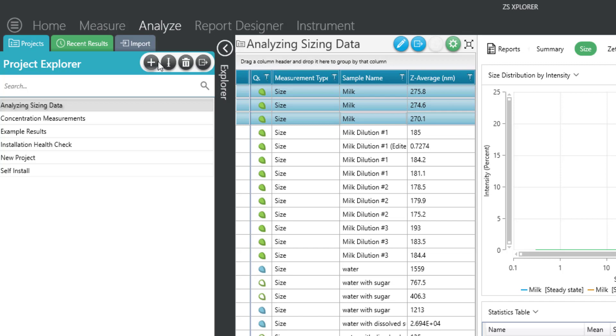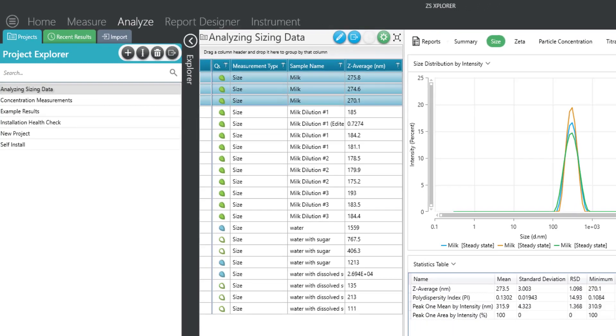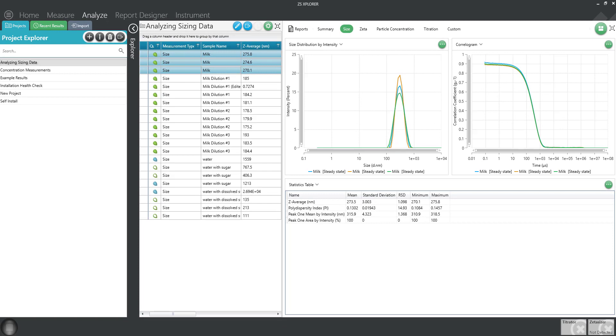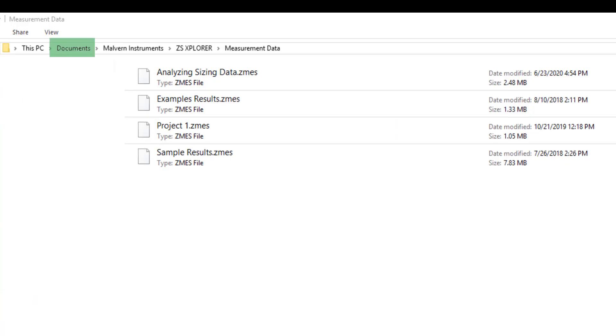Now that you've exported some data, let's discuss how to import on another computer. Provided you've already downloaded the ZS Explorer software from our website on your computer, you can locate the directory in My Documents under Malvern Instruments, ZS Explorer with the folder called Measurement Data.